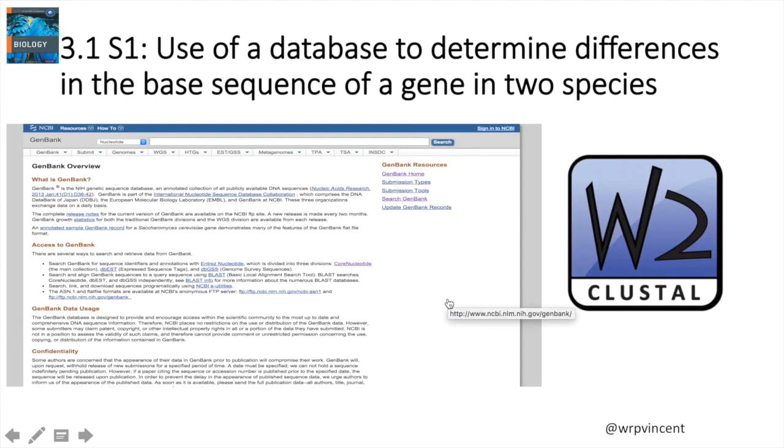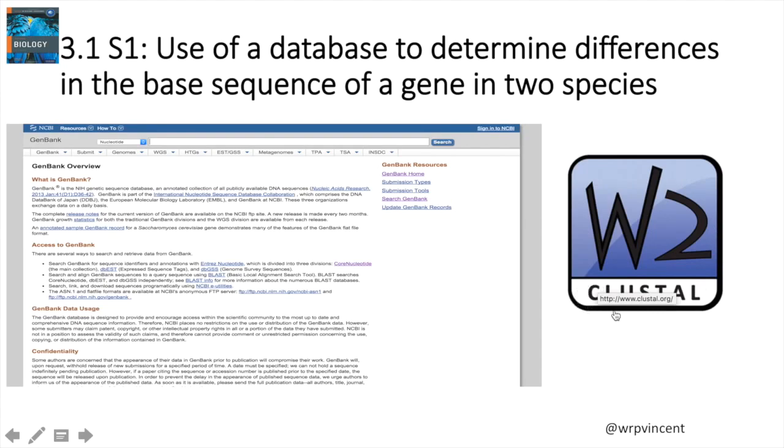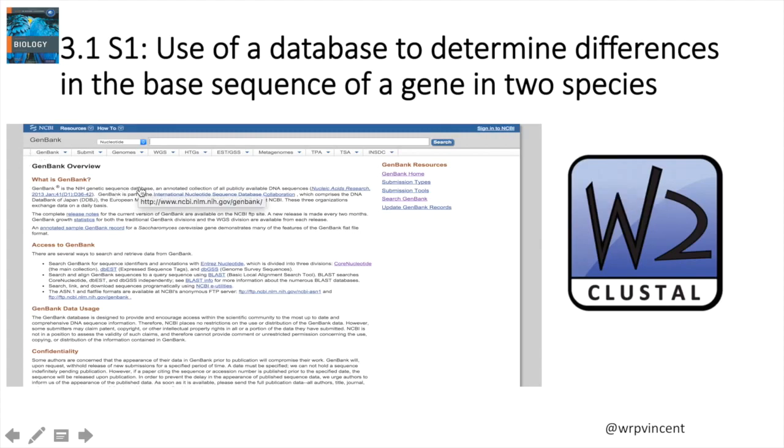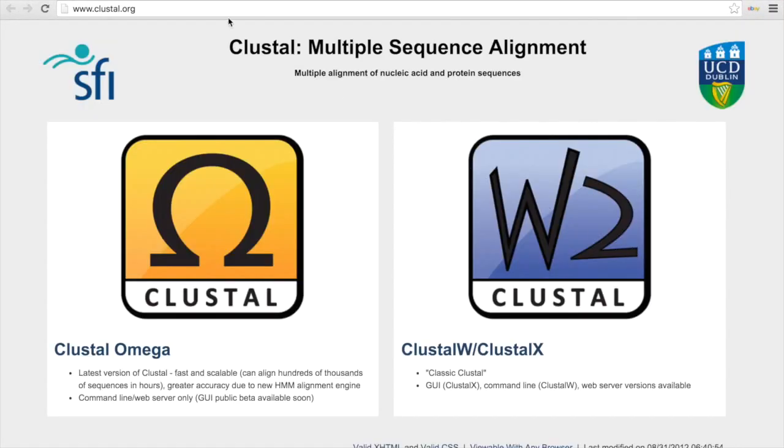There are several things you're going to need for this activity. First of all, we'll need to use the GenBank database online. But first, we'll need to install a piece of software known as ClustalX, and we can use that to analyze the information that we gain from the GenBank database. So first of all, you just need to navigate to the Clustal.org website. We're going to be downloading ClustalX.